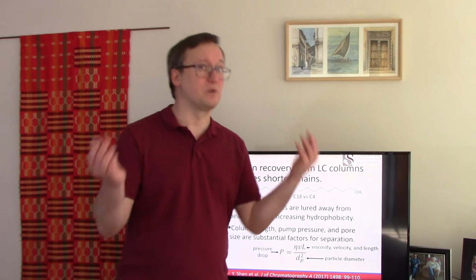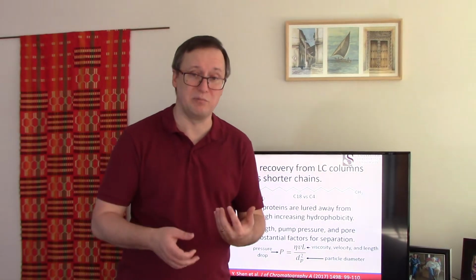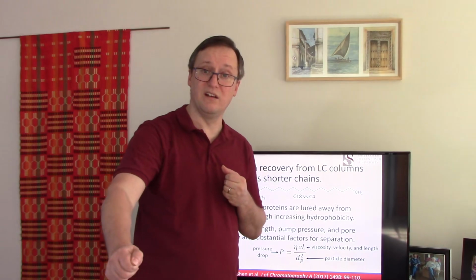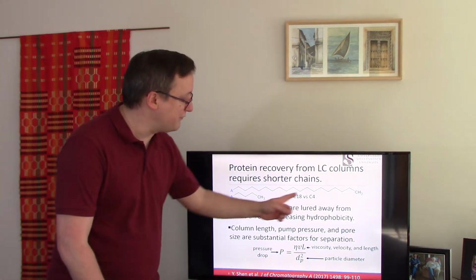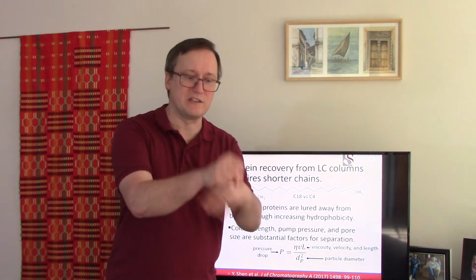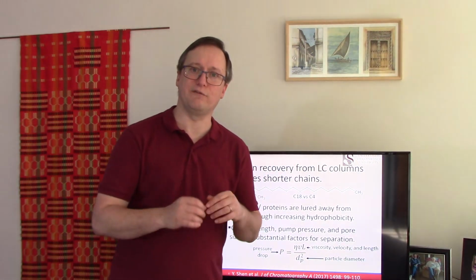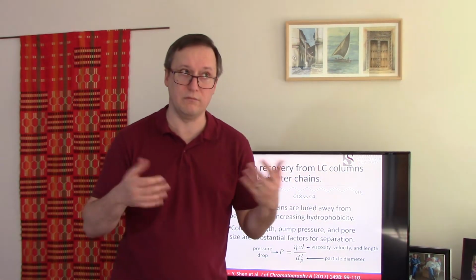That is not so likely if you have a protein. Proteins generally have some sort of hydrophobic region on them somewhere, and it will form a relationship with the C18 material so strongly that that protein will not be removable from the bead. So you'd better have something much shorter to work with. And frequently we find that even just a 4-carbon chain forming the lawn on this little sphere, this little bead, is about right in hydrophobicity for us to capture the protein, but be able to release it through a hydrophobicity gradient.